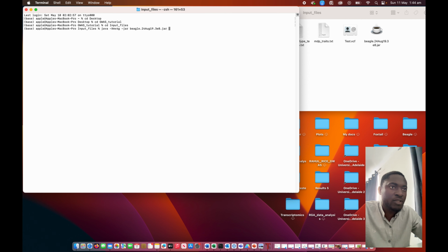And then you call the input file. So our input file is test.vcf. Next you tell the Java how to output your file, or the name to call the output file.